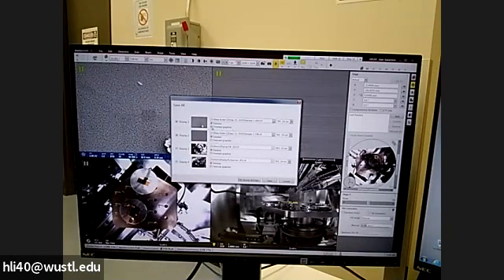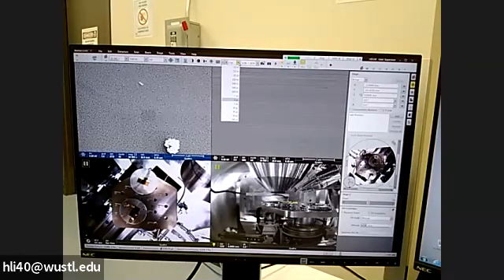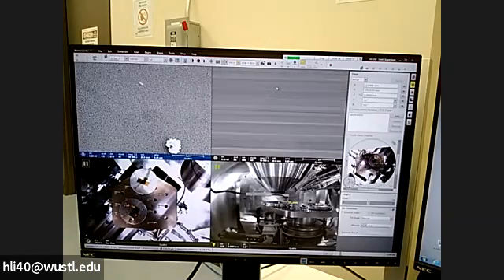The next thing is overlaid objects. If you happen to use annotation, you may use the overlaid graph to have these annotations on the image. Otherwise, you don't use it. Then you just select Save. So this is how we record images and save them into files. Normally, I suggest users record a number of images. Afterwards, I click the pause button off, click integration off, and change the scanning speed back to fast.